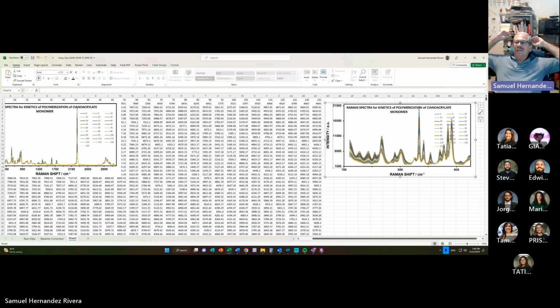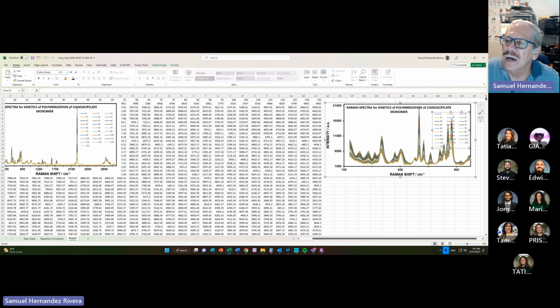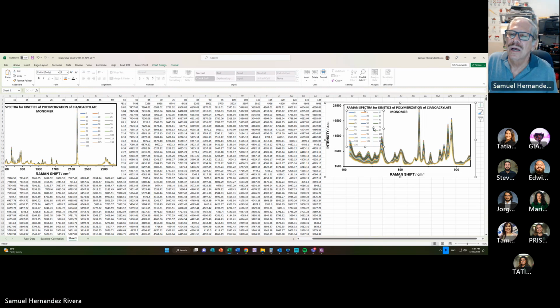So this is my new spectrum. Since the table of times for the spectra is now interfering with several of the signals, I move it around and optimize it so that it doesn't interfere. Good.